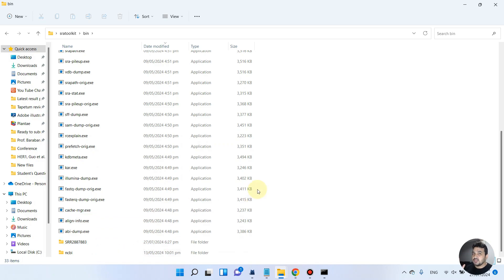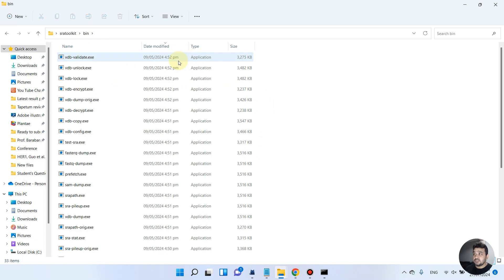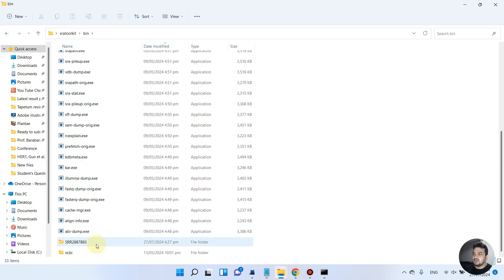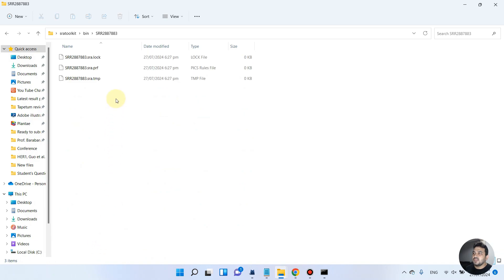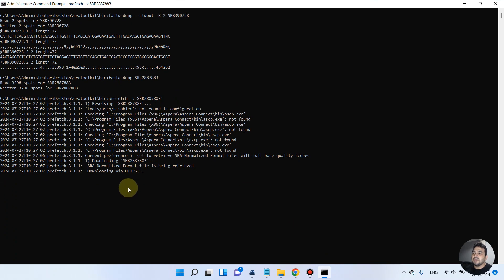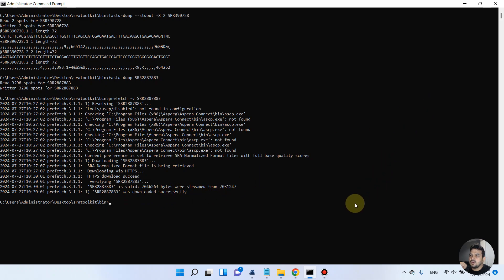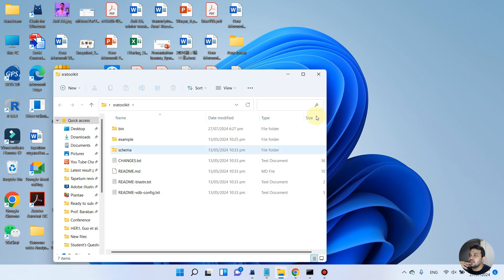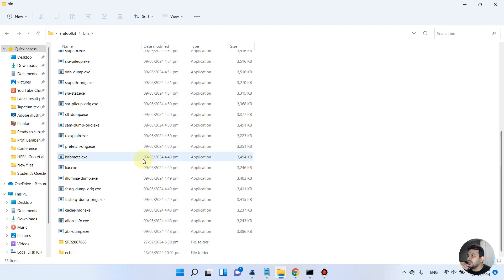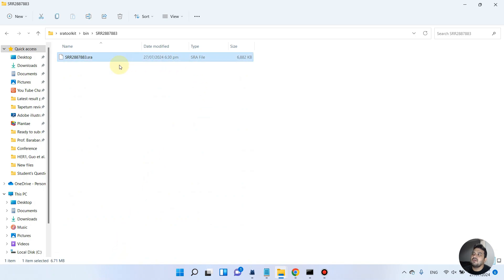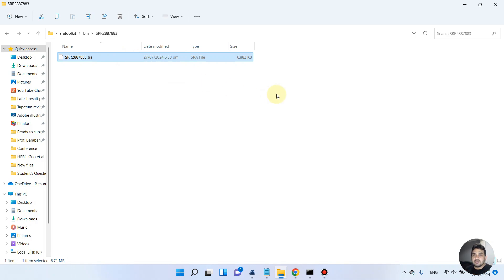When using fastq-dump, the file is downloaded directly into the bin folder. When using the prefetch command, it generates a separate folder with the accession name. Now it is showing the message that the SRA was downloaded successfully. Checking the bin folder, we can see our file in the form of an SRA file.